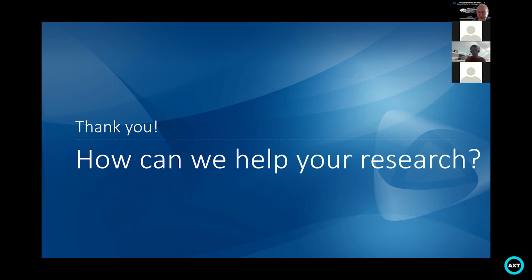That is a great question. I think we would have to work on the specific protocols with you to try to reduce the signal in that case. What we've seen from the different application areas that I've highlighted today, and also some of the studies we've done at UC Irvine, is that we try to quantify things on the minimal side, where we can barely detect the signal. That's where I think the instrument can highlight its capabilities. So specifically with photobleaching, we can talk a little bit more offline about that.